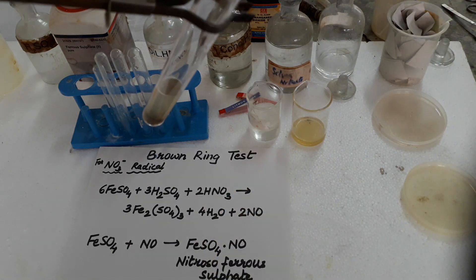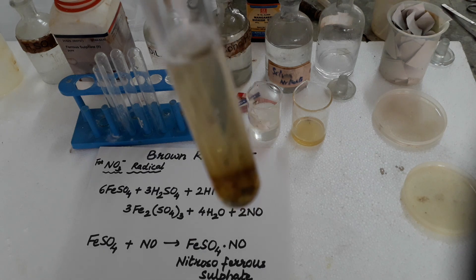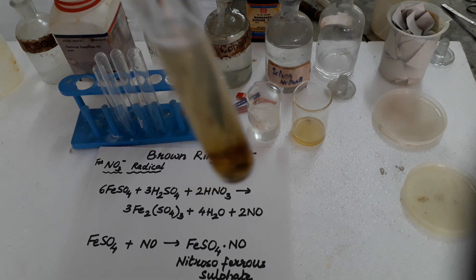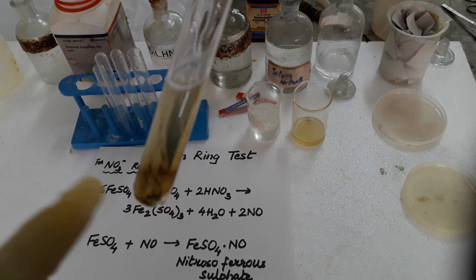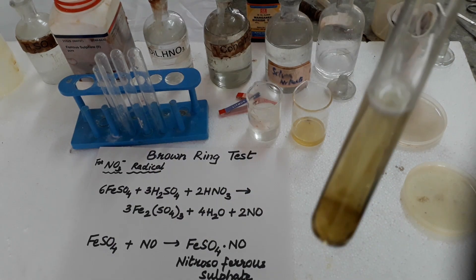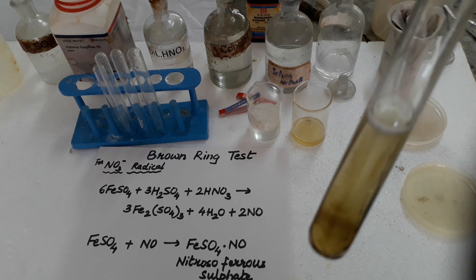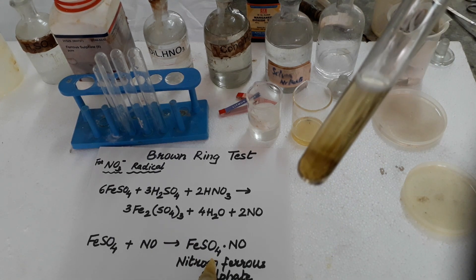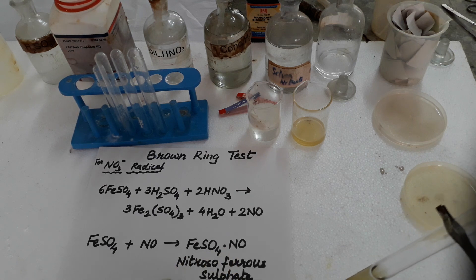You can see here the ring. You can show it from this side — you can see here the brown ring is formed. Look at this, the brown ring test — here the brown ring is formed. And this brown ring here is of nitrosoferrous sulfate, FeSO4·NO, that is called nitrosoferrous sulfate, which is the brown ring.